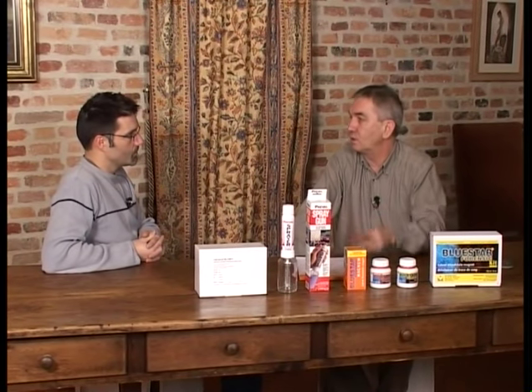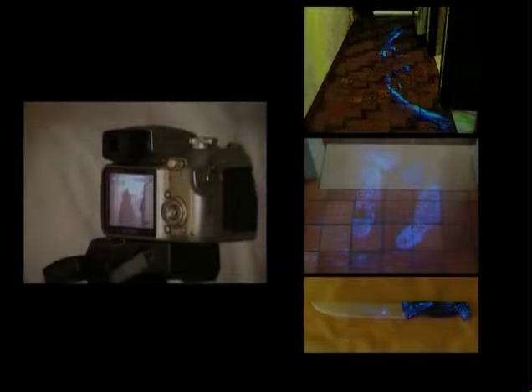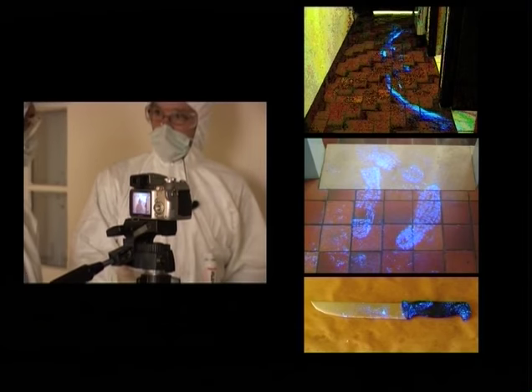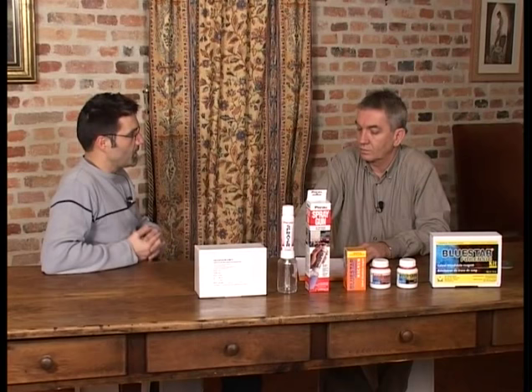And now I believe we need to discuss the use of lights. We are frequently asked whether we should use UV lights or other lights with special filters. In terms of photographic technique, you have seen that we did not use UV light or any other at any stage. We do not use any extra light. The only extra light that we can think of is when we are in a very dark environment, as we were able to see in this recess, where we had no light and we were in pitch darkness.